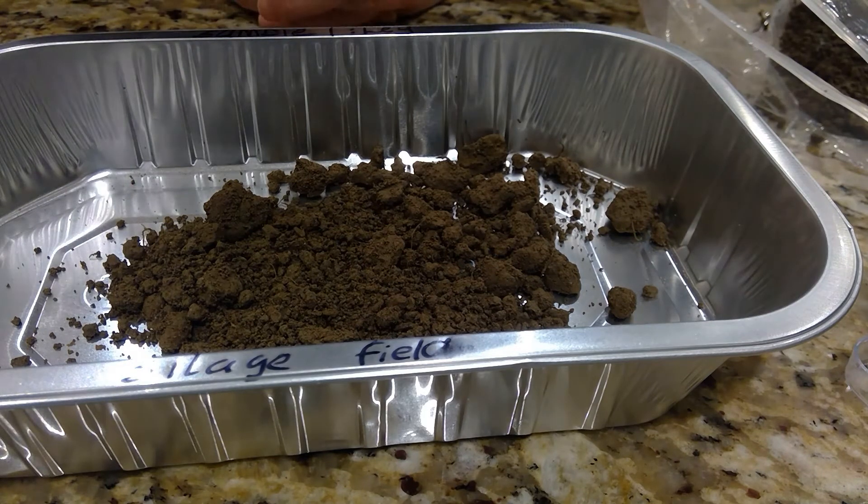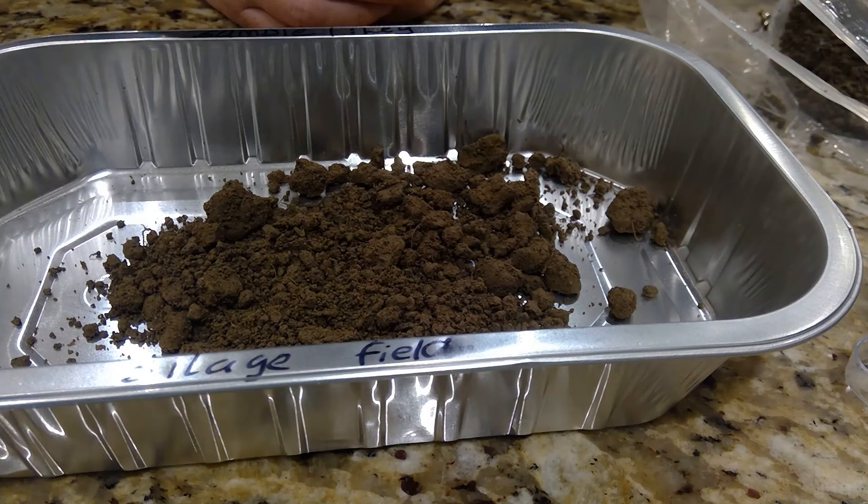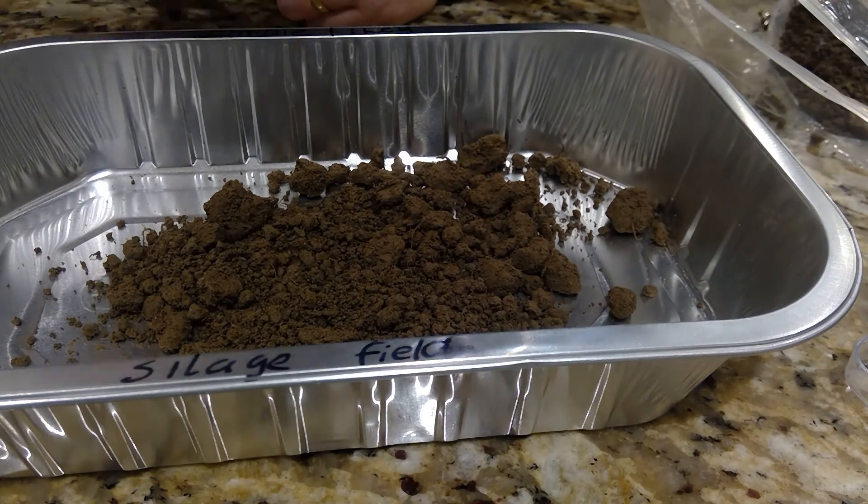After 10 minutes, come back and check, then put it back in for another five minutes. Wait again, and once the mass of the soil sample remains the same, you know it has lost all its water.